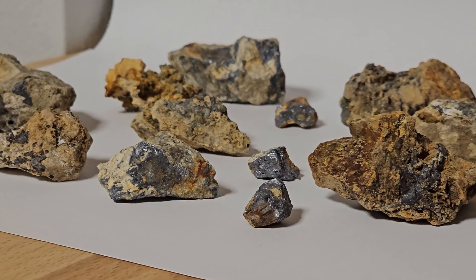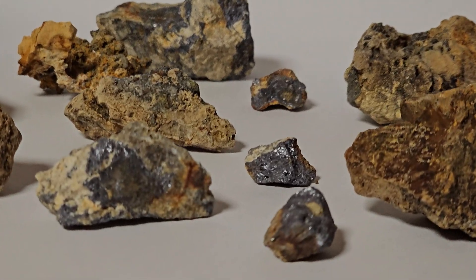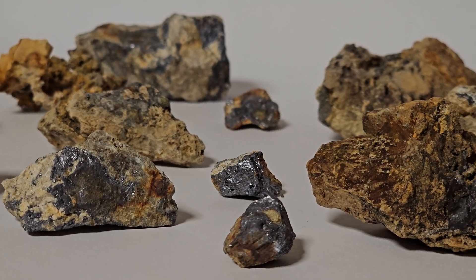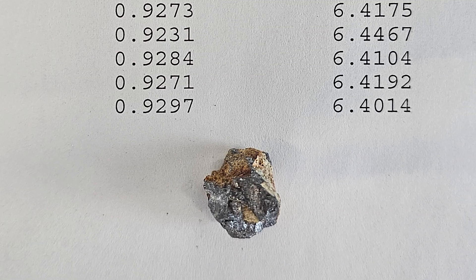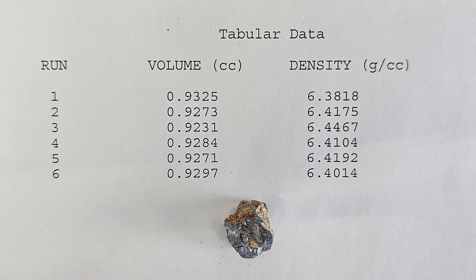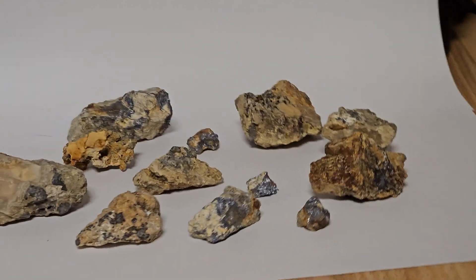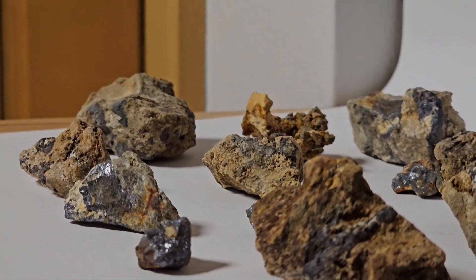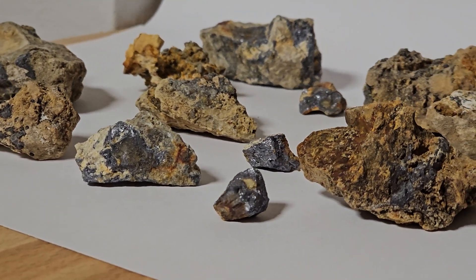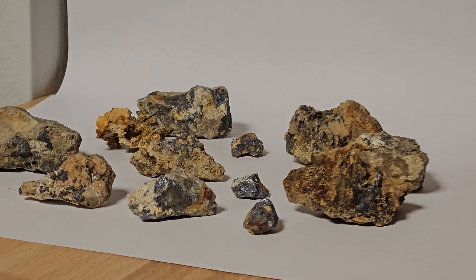We first started with an examination of our galena samples. We found this shiny piece of pure galena and decided to subject it to a density analysis with a helium pycnometer. The results were intriguing — a density of 6.41g per cubic centimeter, a tad lower than the expected 7.4 for pure galena. This variance hinted at the presence of other materials mixed with the ore, albeit the sample's considerable weight was a promising indicator of its lead content.